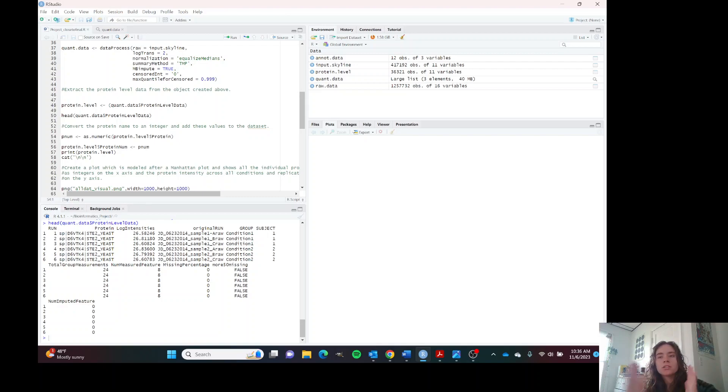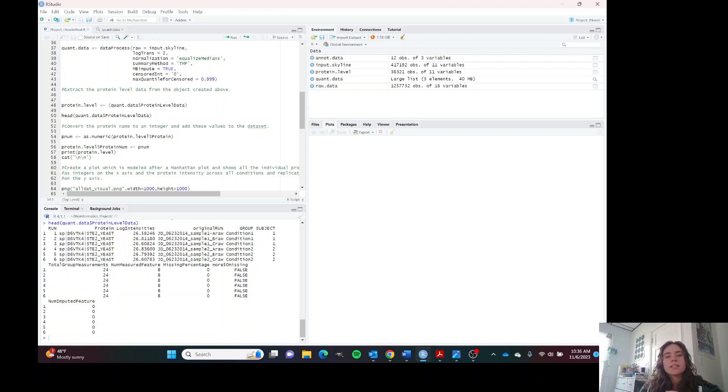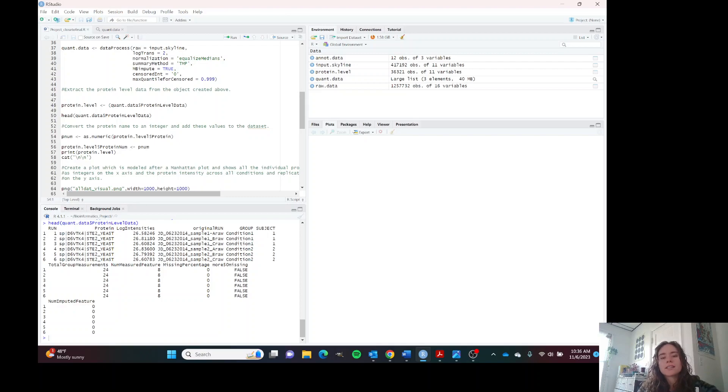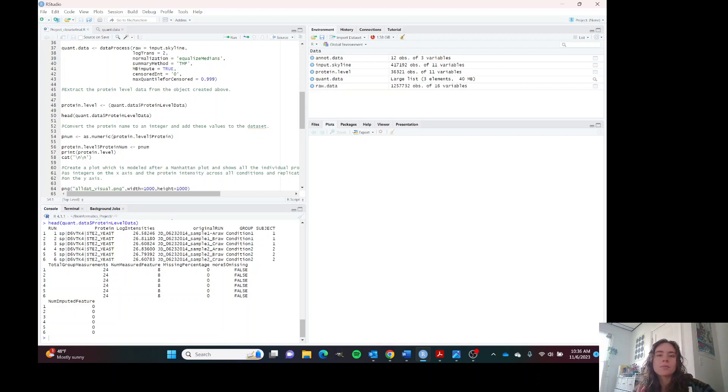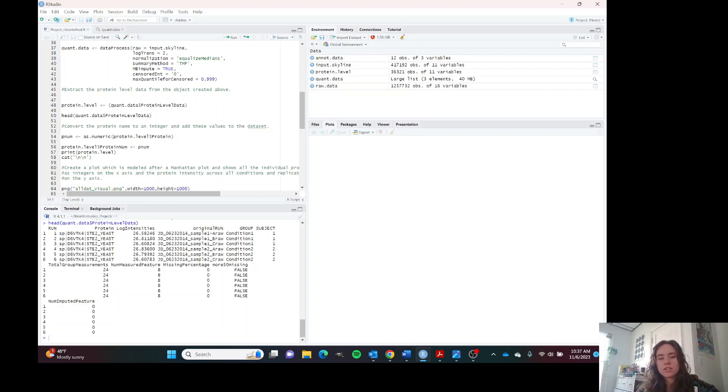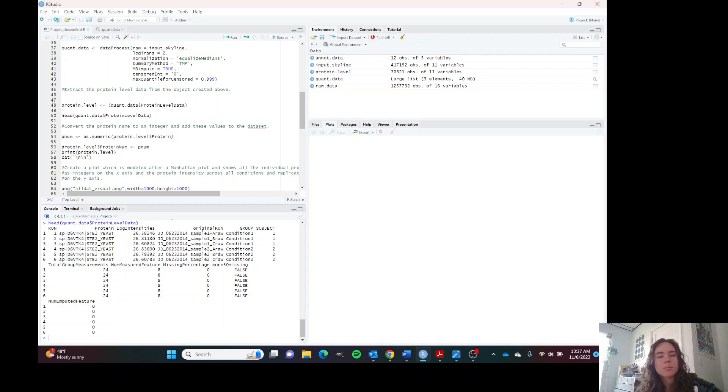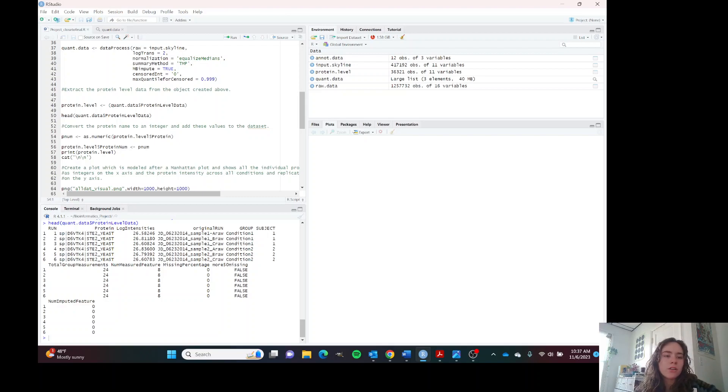A Manhattan plot is where the chromosome is on the x-axis, it may be one to 26 chromosomes, and each SNP is plotted on the y-axis above the chromosome. That SNP corresponds to that chromosome that it's under or above and the log p value for that SNP is on the y-axis. I took that idea and tried to make a visualization in R that was kind of modeled after that because this data set is so large. We do need to change all of the protein names to numbers.